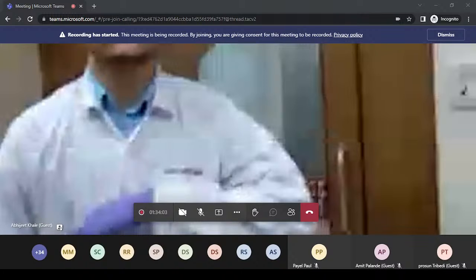To perform each step involved in HPTLC analysis, there is a separate module in the CAMAG HPTLC system. Now we will see one by one the important modules involved in the system. This is a 20 by 10 centimeter TLC silica gel plate. Pre-coated plates are mostly what we use for day-to-day analysis, manufactured by different manufacturers. As per the number of samples and standards we want to analyze, we can select a suitable plate dimension. The system is compatible with 20 by 20 centimeter or smaller plates.